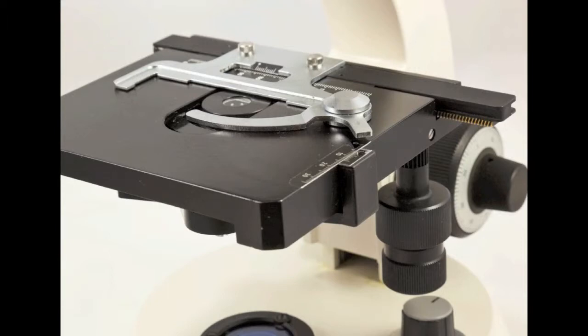Now let's look at the stage in more detail. In older microscopes, the stage is simply a flat surface on which to place the slide. On most modern microscopes, including ours, the stage is a fairly complex mechanical device.